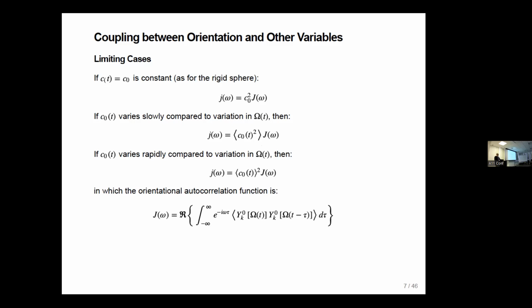So if you think about protein NOEs, where the distances might vary, what might be a case where you would expect slow motion internal to the protein that would change the distances to some spin? Global composition is changed, right, but I'm thinking about some specific thing. This actually is problem 14.